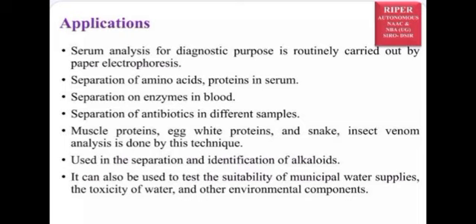It is also used for separation and identification of vitamins, minerals, and radioactive substances. It is used for separation of fluorescence producing pharmaceutical compounds. Next use is serum analysis for diagnostic purposes, also the separation of amino acids and proteins in serum.